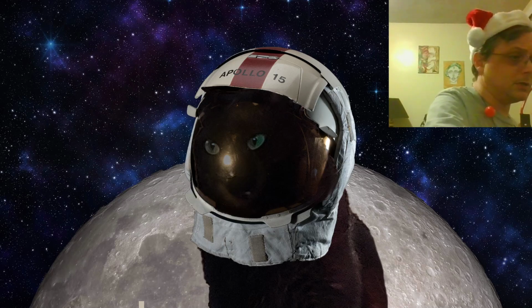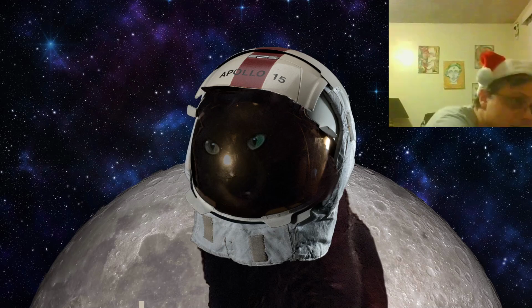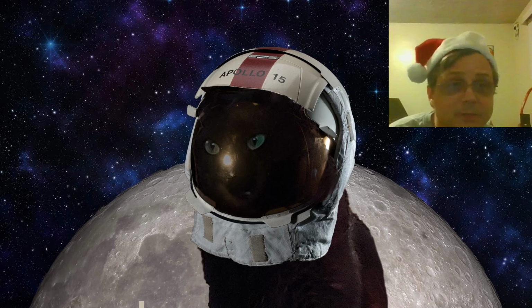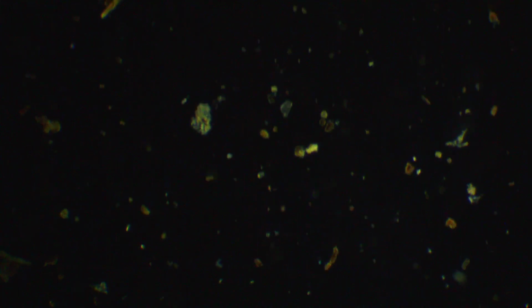I'll put this slide up on the stage. I turned the light off this time, so then I can turn the light on. Try to get this up to the top. I'm still blinded. I gotta wear shades when I do this or something. That light really gets me. Alright. What do we got in here?